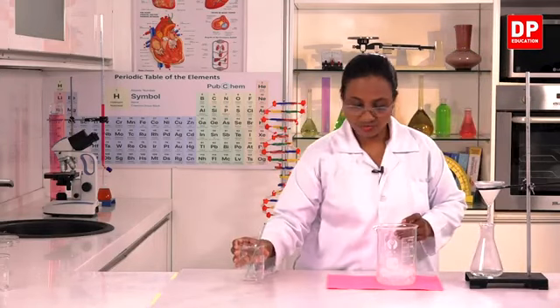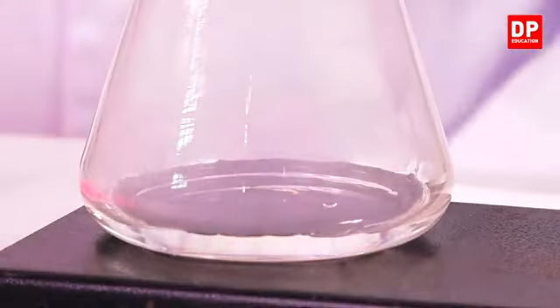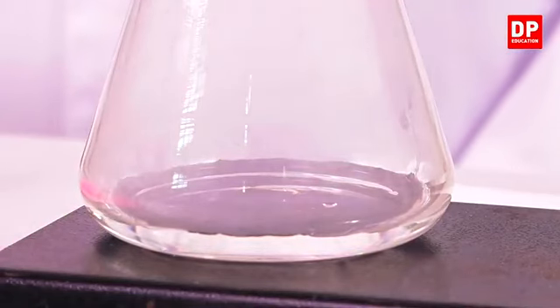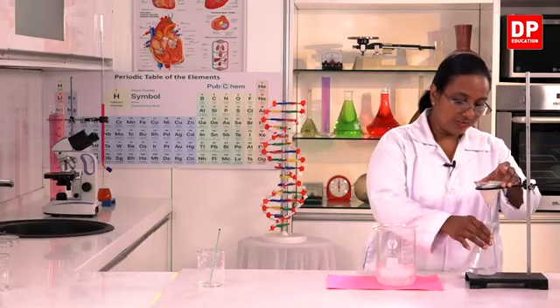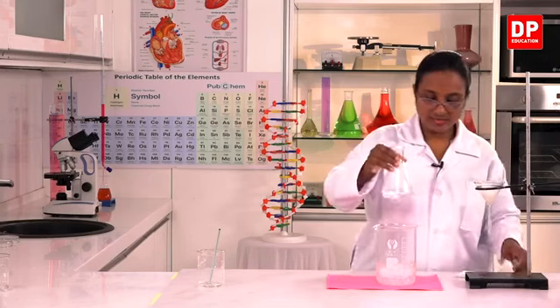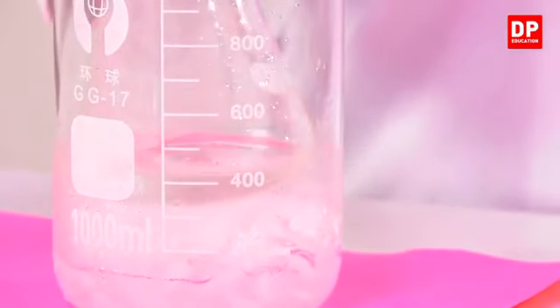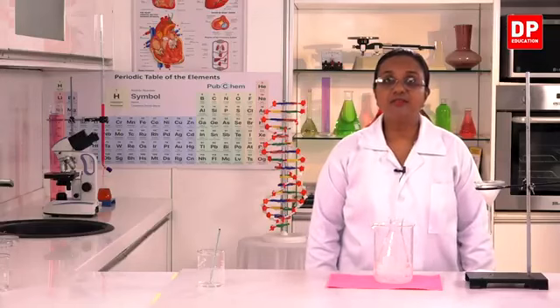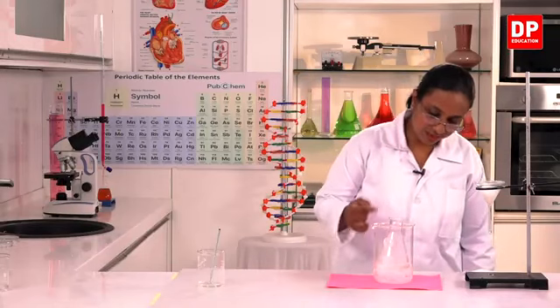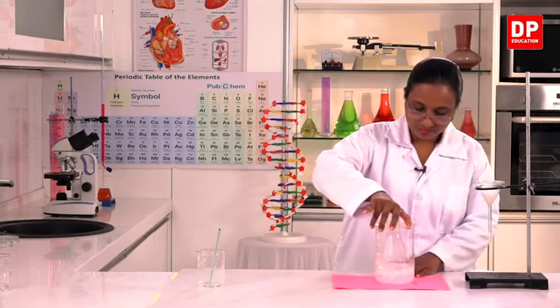So now I have transferred most of the solution into the funnel. We'll have to wait till it filters. Now the solution has been filtered so that I can remove the conical flask and place it inside the beaker containing ice. I will hold it there so you can observe the formation of the crystals. Now you have to observe clearly inside the flask.